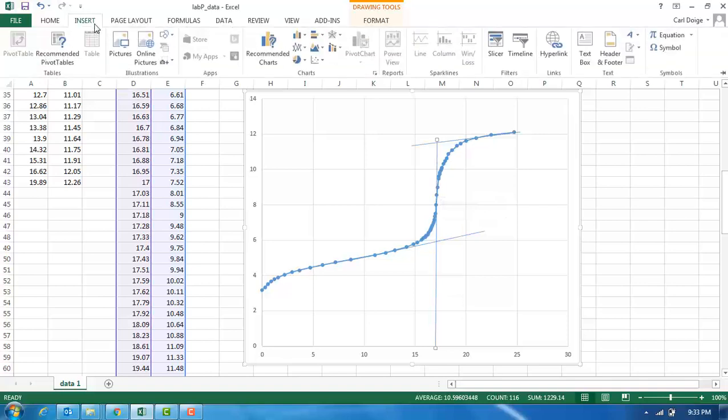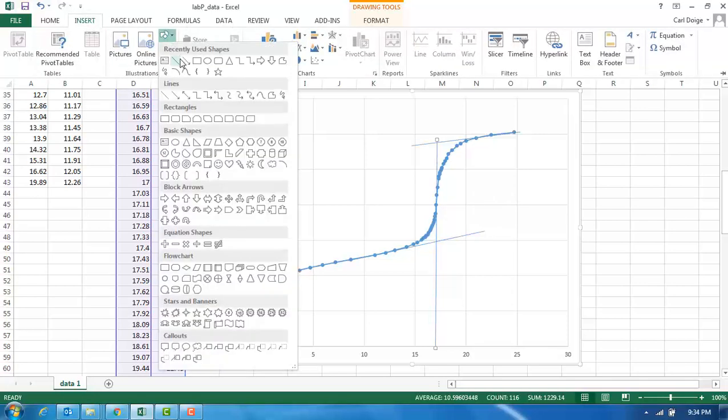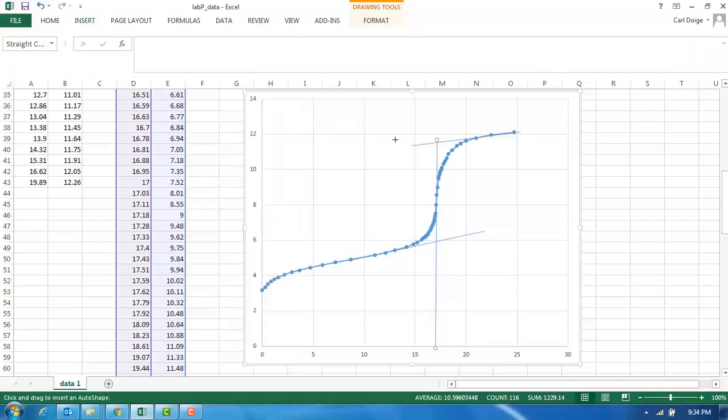And just so you can see where I'm aiming, I'm going to draw another line here, and I'm aiming for about 8.75. And you'll see there's no exact data point to match that, but we'll find the best data point that we can in terms of the various data that we collected. So the pH at the equivalence point is about more or less where I've indicated this intersection.